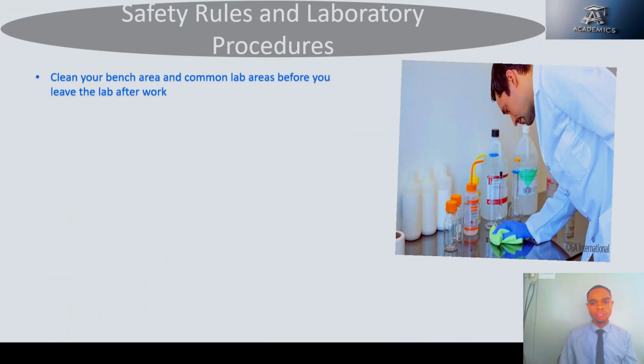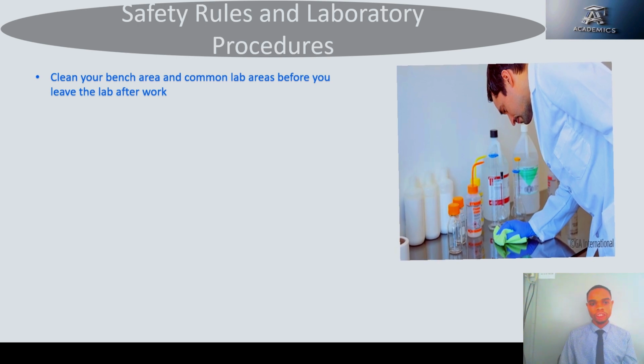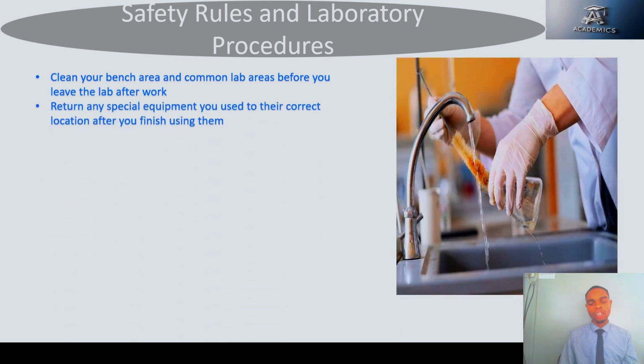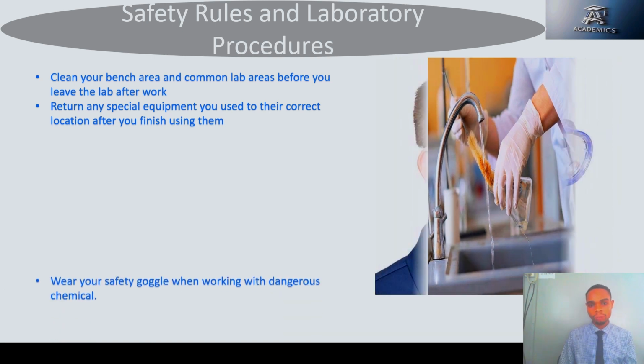Okay. Always clean your bench before you leave your work. Arrange your stuff before you leave, and make sure you wash and return your equipment to the location you collected them from after you are done with your experiment, so that it will enable other people to easily locate them when they want to use them.